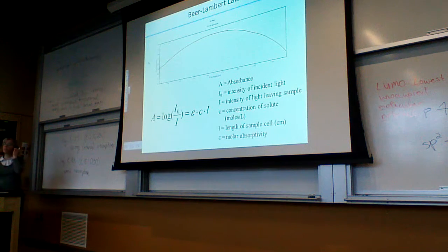And you can calculate those. The one thing to keep in mind, though, is you can only calculate epsilon if you have a very pure sample. So only that compound is in there, or even only that one species of that compound is in there. Sometimes we have different proton transfer states and things like that. That complicates the absorption. So you can only do it if it's one single pure species in there. Otherwise, the epsilon doesn't mean a whole lot.